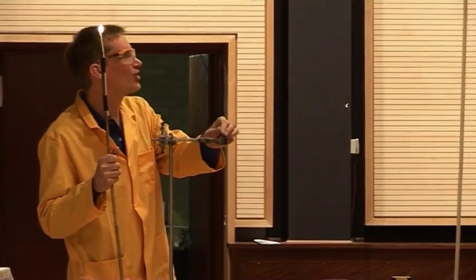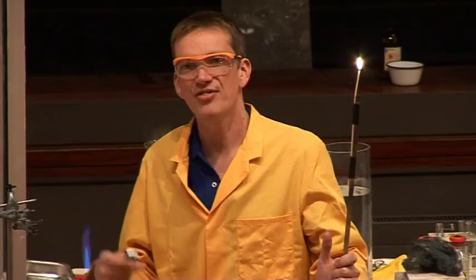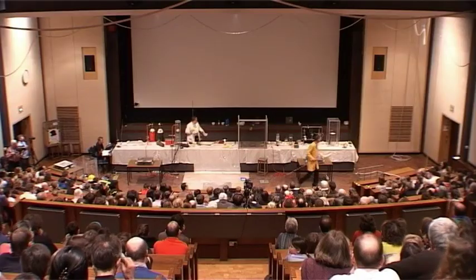Oxygen itself does not burn. Okay, so oxygen doesn't burn. It needs something to combine with. You've seen things burning in oxygen. In fact, if I tried to light a jet of pure oxygen, we'll see it wouldn't burn at all. Let's try it.